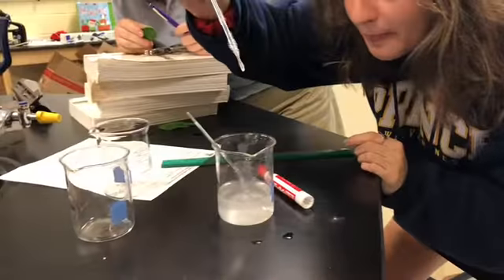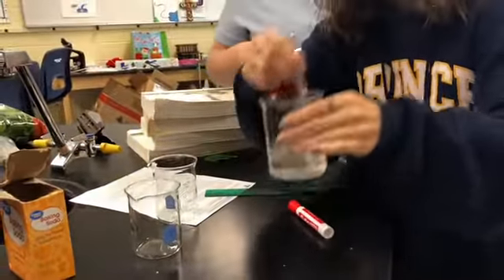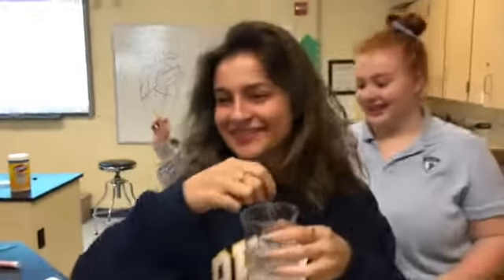Materials: baking soda, 100 milliliters of water, soap, living spinach leaves, a hole puncher, a beaker, a phone for timing and taking a video, a syringe, pink light, and sunlight.